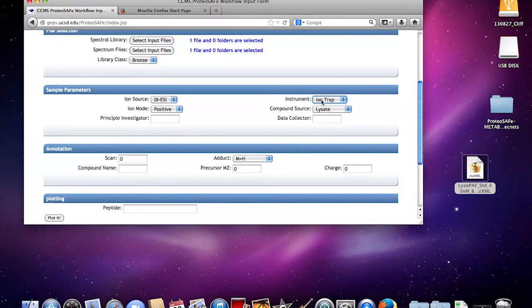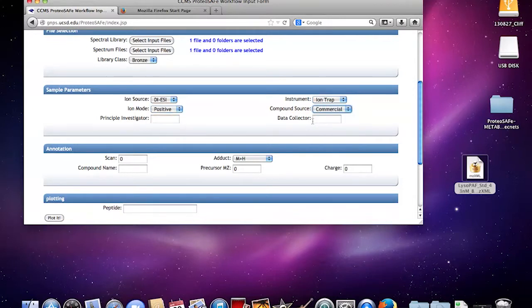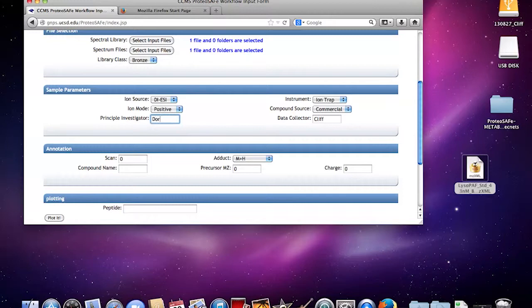Data collector would be me, let's call it Cliff, then principal investigator would be Doris Stein.